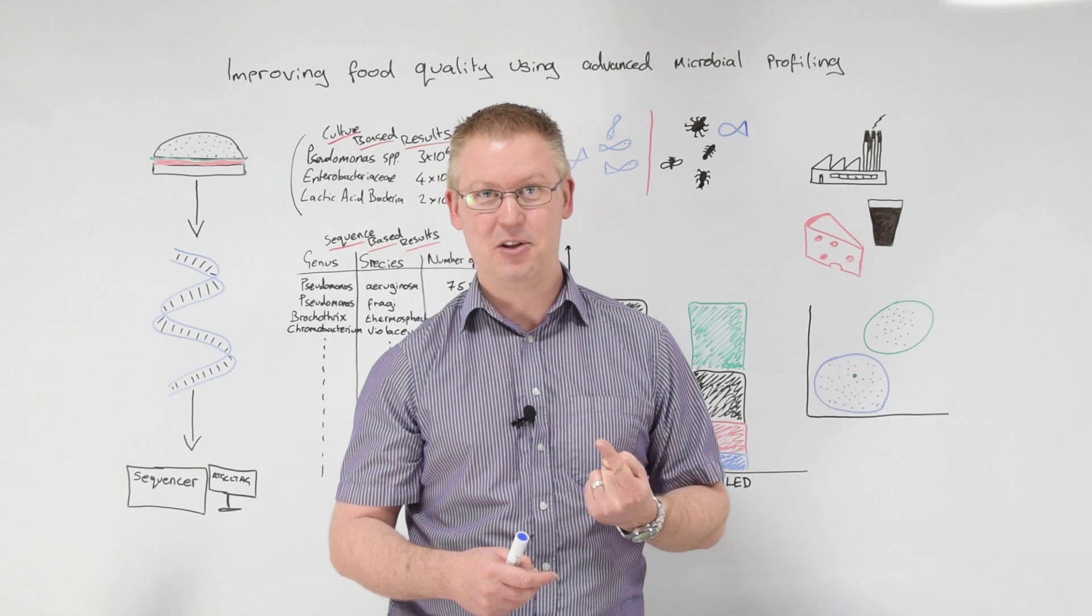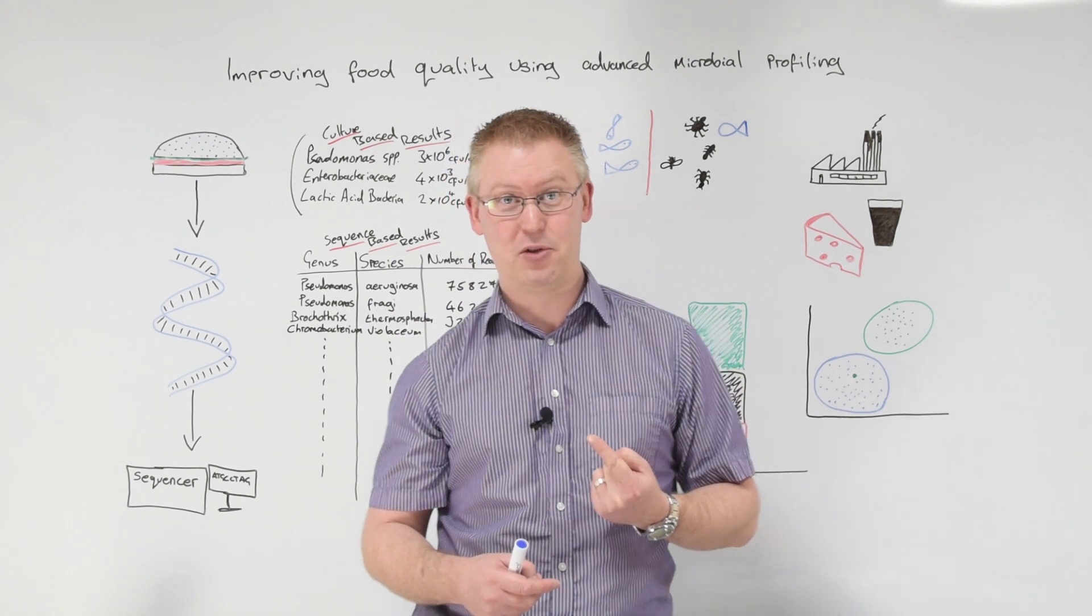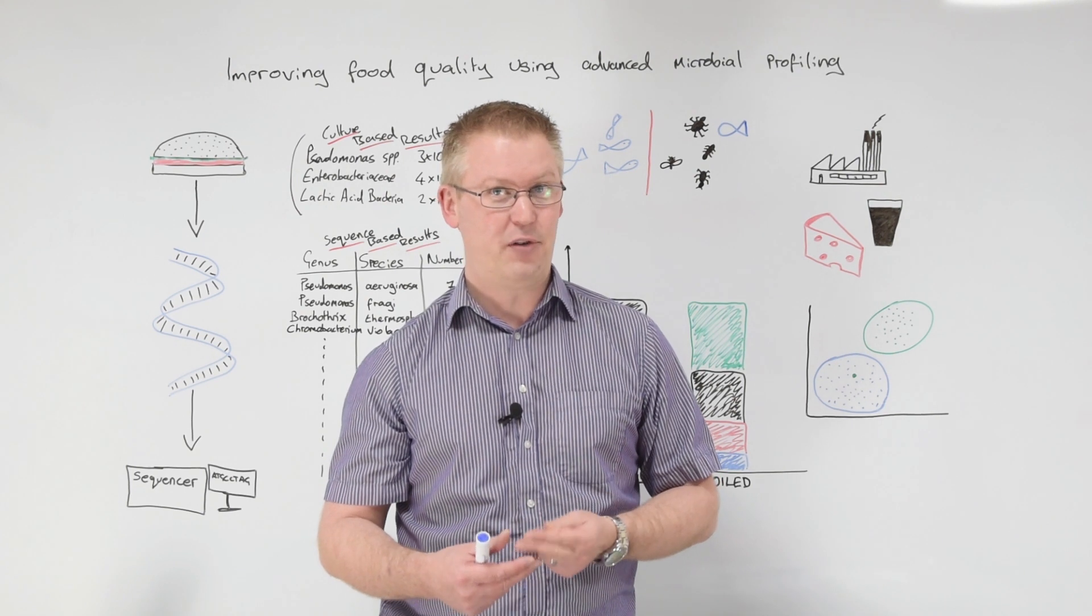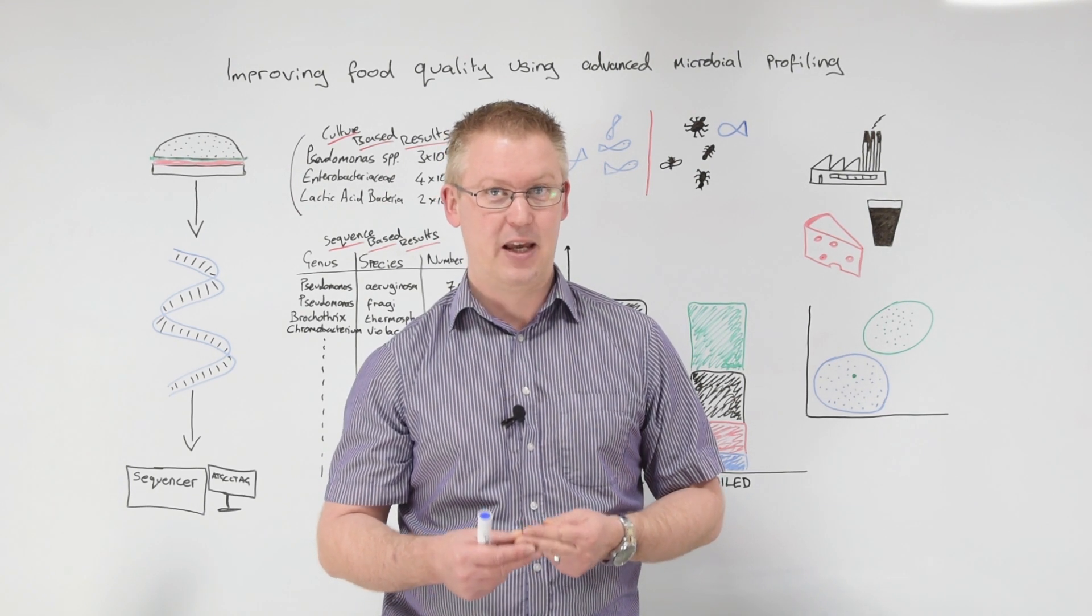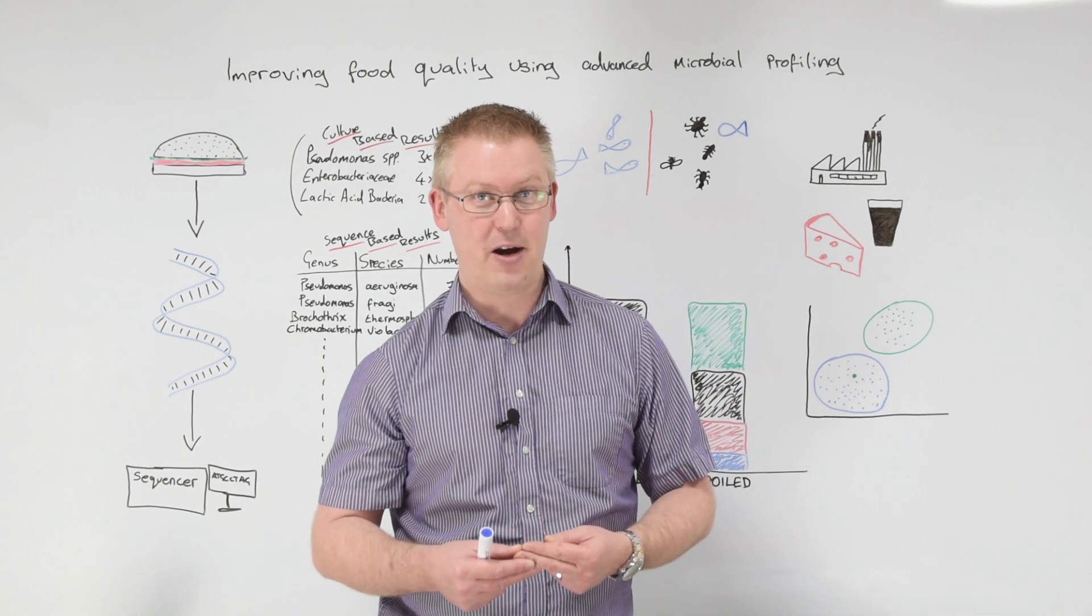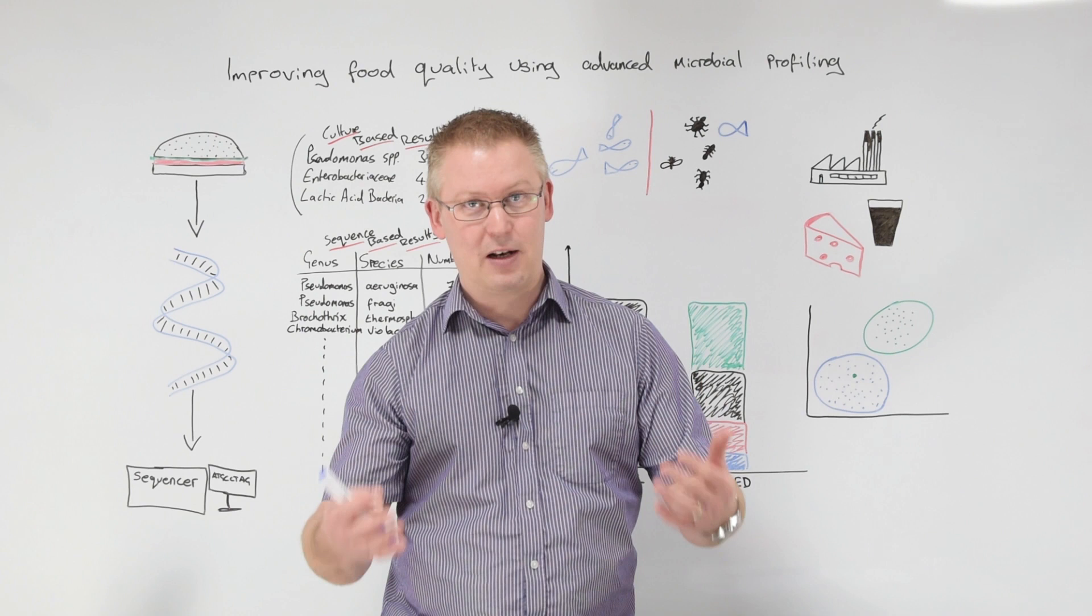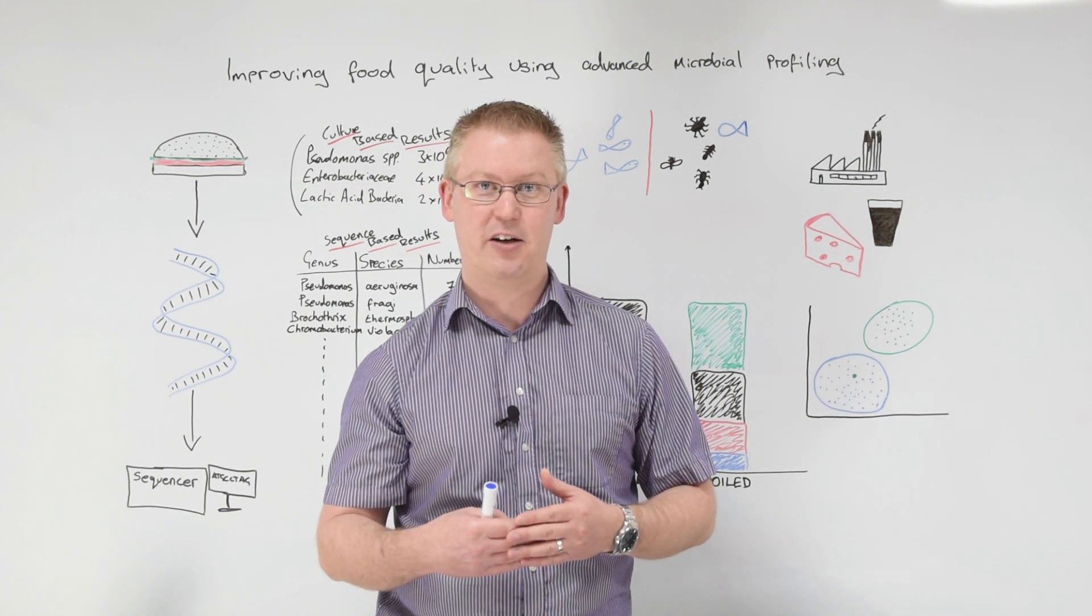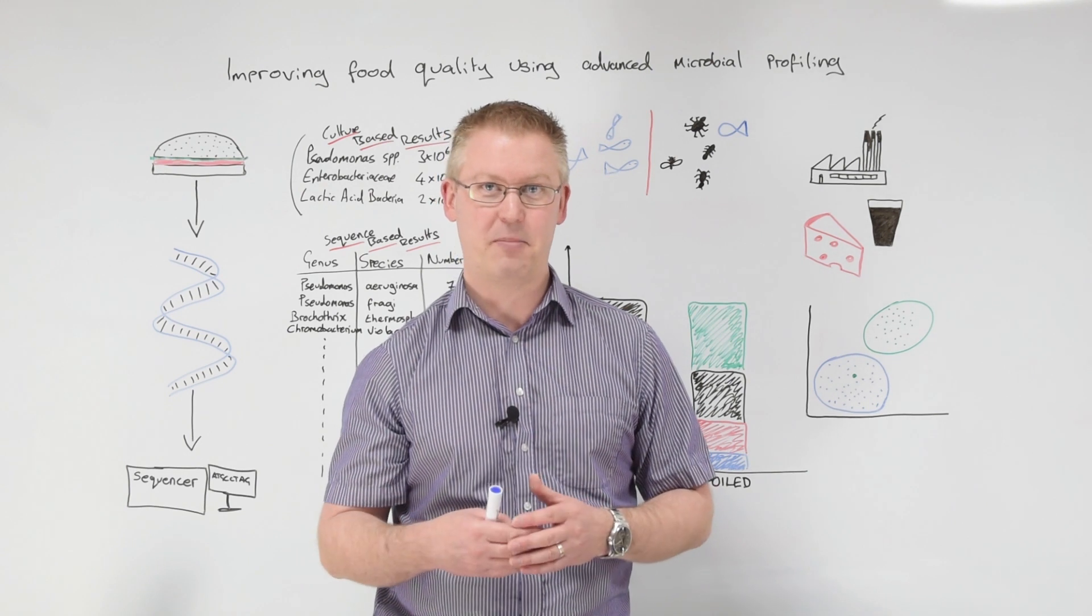One, it was likely to be the causative agent of the spoilage we saw because it produces pigments. And number two, it shouldn't have been there in the first place because it only grows in the presence of oxygen. And these packs were supposed to be oxygen free. So when the client got that information back, they could run an investigation on their packaging line. And lo and behold, they did find a fault with the packaging.